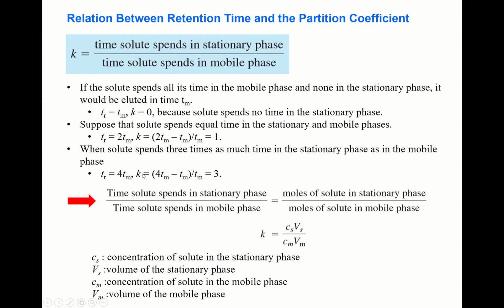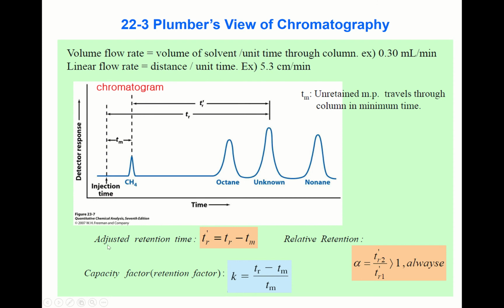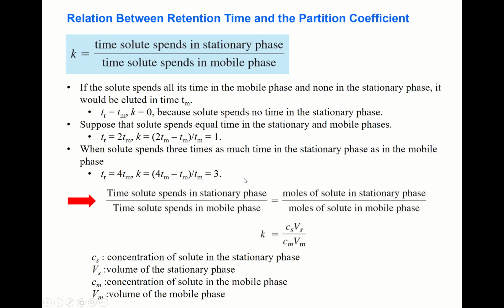Let's consider the relation between retention time and partition coefficient. In a previous lecture, we learned the partition coefficient. If you are confused, go back and take a look. The k here is the retention factor, or capacity factor, that we defined.